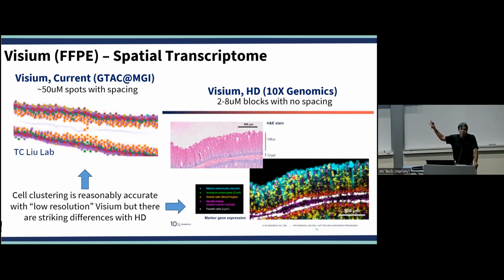Now, keep in mind, Visium HD won't be out for about another roughly 6 months, we're hearing, sometime in the first half of 2024. So, targeted versus whole transcriptome, higher resolution, lower resolution. Here you do have to go back and sequence. So there are a number of factors to be considered.